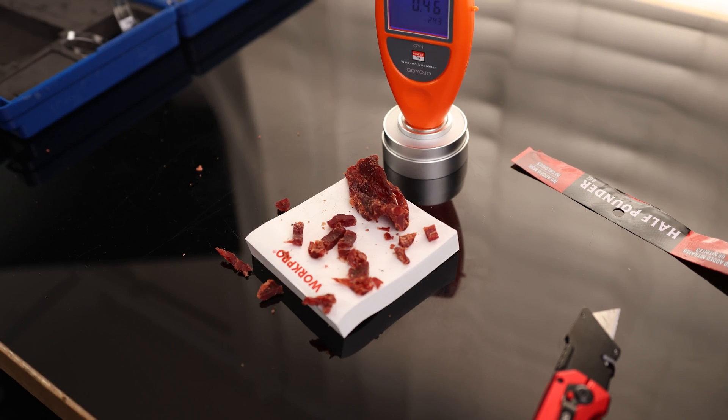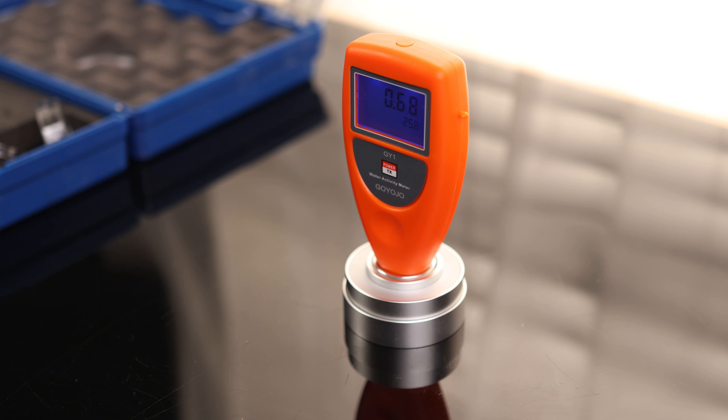We're going to let this sit for about 5 minutes. We got a reading of 0.68, so that is a little bit on the high side. Ideally you are looking for 0.65 or under. So this jerky is a little bit on the high side for water activity — neat to know. Overall, that is a very cool meter.